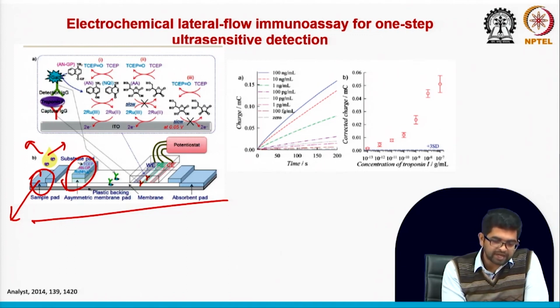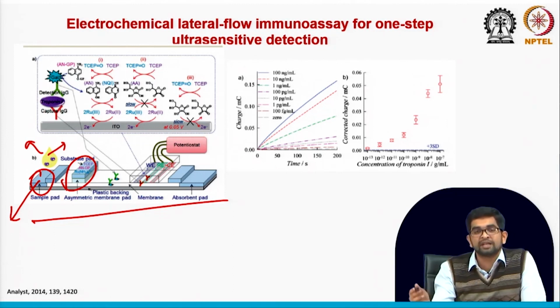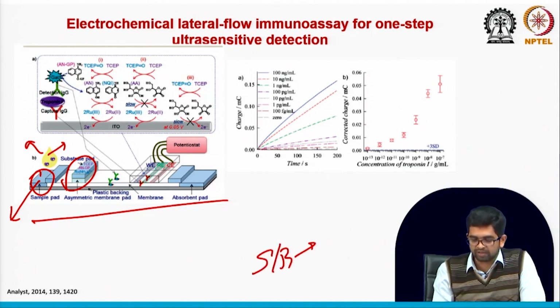And the substrate pad we need here because in the electrochemical sensor, as I taught you, we may need to use electrochemical-chemical redox cycling. I think you can remember from the last few classes why we need this kind of redox cycling: to amplify the signal to background ratio, so that you can go for an ultra sensitive biosensor.